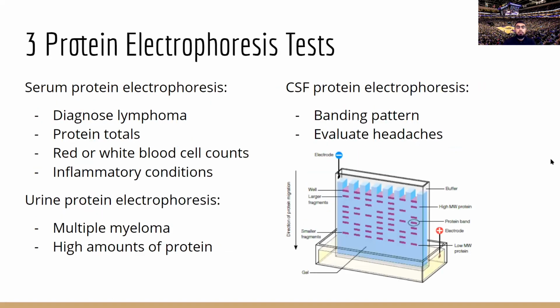The purpose to focus on with protein electrophoresis is examination of proteins, which are important building blocks to all cells and tissues in the body. Having knowledge of which proteins are present, absent, or in a decreased amount in body fluids can be beneficial in diagnosis of various diseases and conditions.